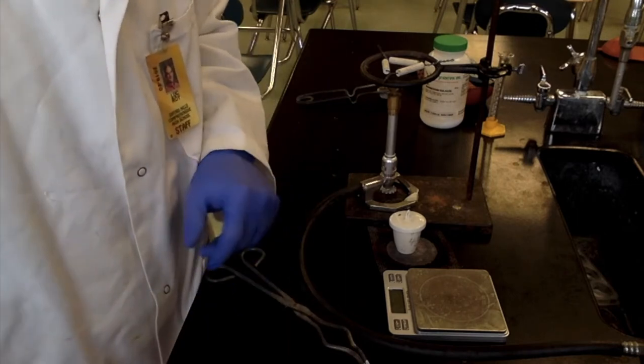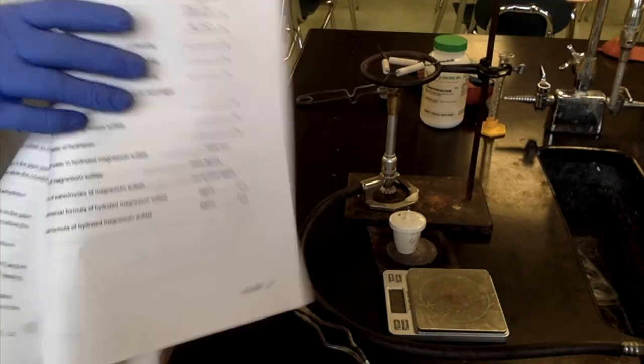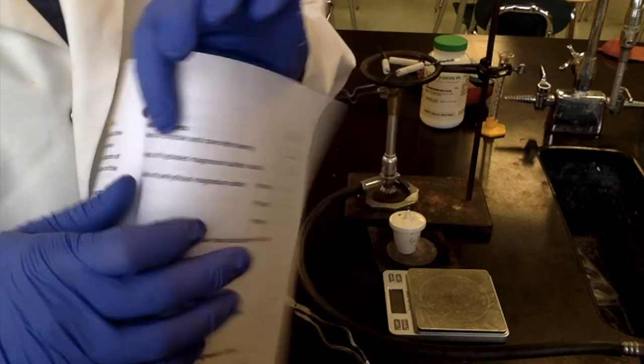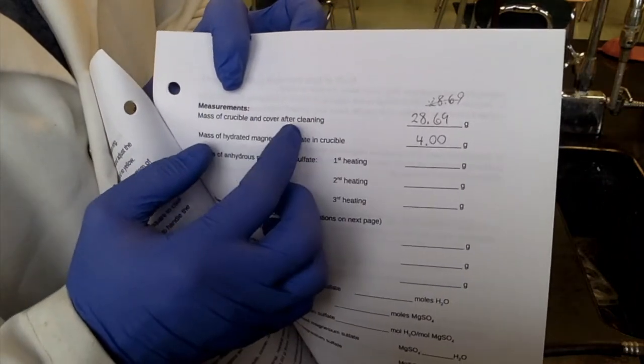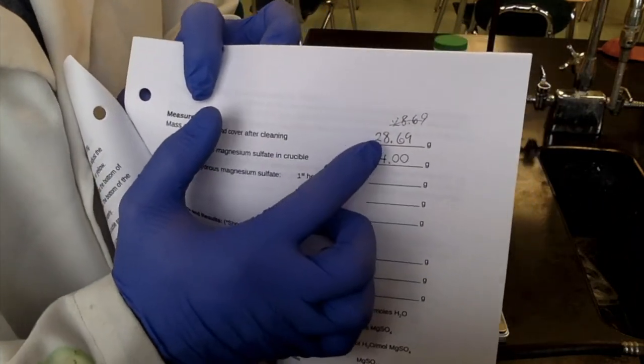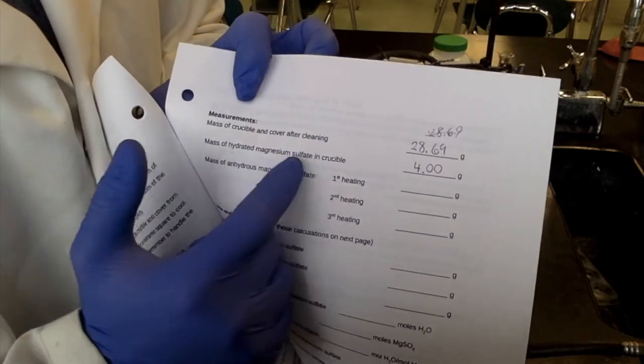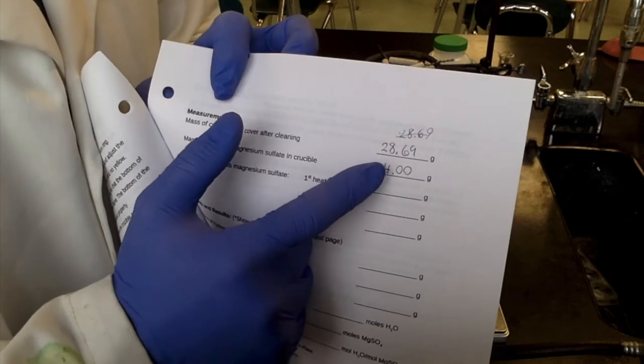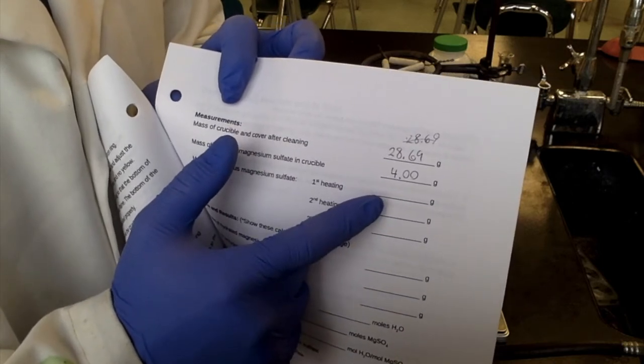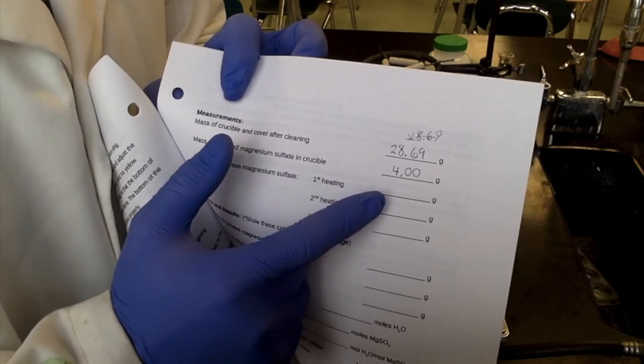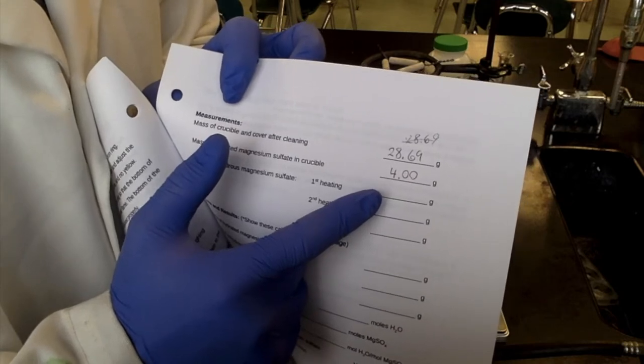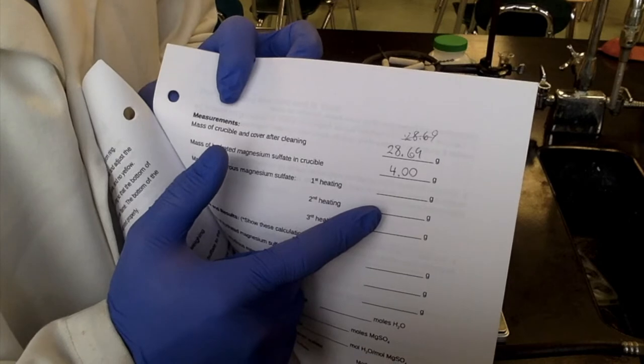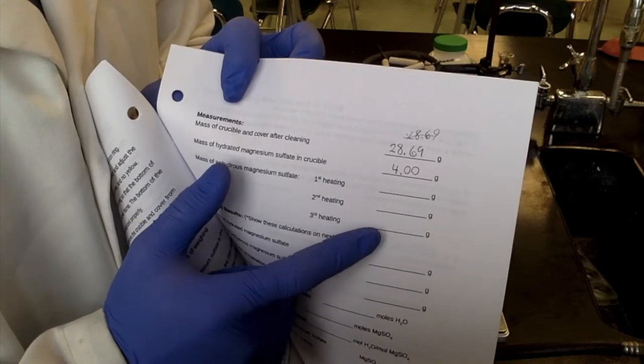And that's going to sit there and cool for another five to 10 minutes, before you can get an accurate mass measurement. Just to review the measurements we've taken so far, we had measured the mass of crucible and cover after cleaning at 28.69 grams. And I weighed out the magnesium sulfate to five grams, exactly. So now we're going to see after the first heating, how much the mass has changed and then we'll do a second heating for sure.